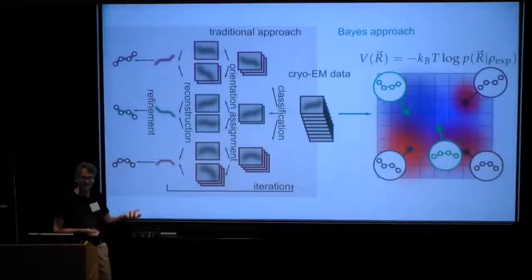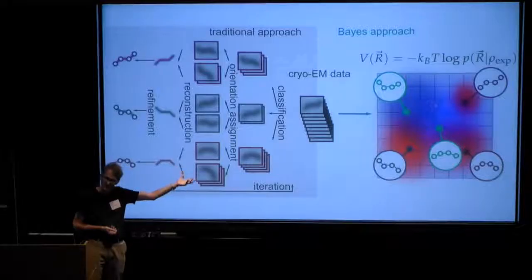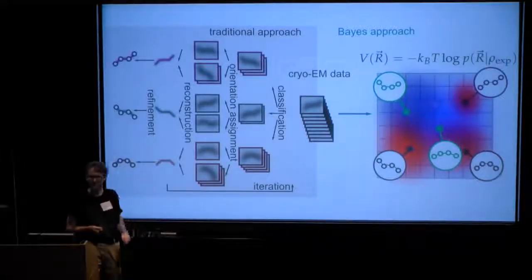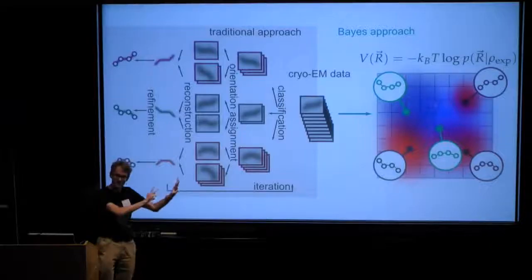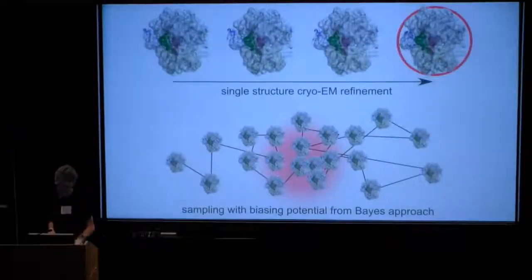What is the likelihood of my simulation visiting different parts in this high dimensional space? And then from that, start to bias this so that maybe the red is likely the high energy and the blue would then be the low energy. And gradually I should then push my simulations to only sample the blue parts. And if this works, and I think we'll do that eventually.